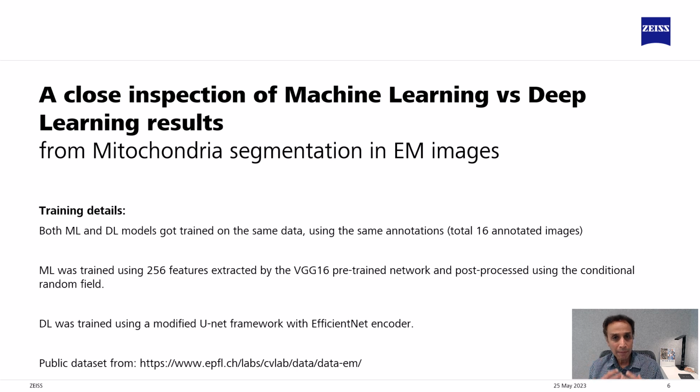And for deep learning, we used a U-Net framework where the encoder was replaced by an EfficientNet encoder. Let's have a look at the results now.